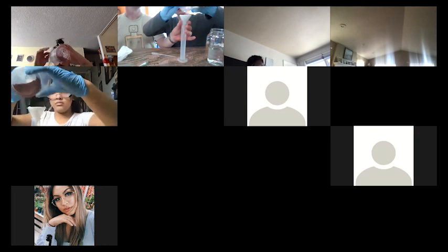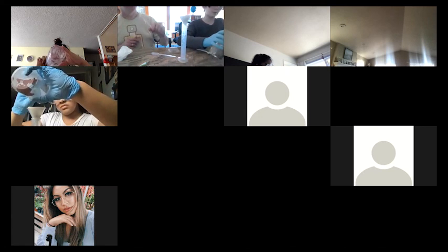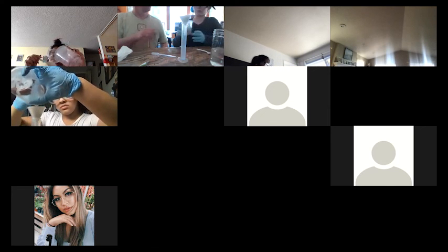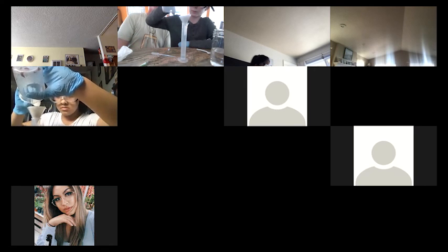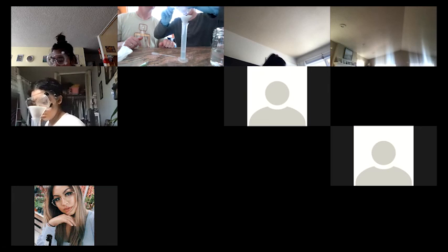There you go. Now to get the rest, you can just dump some water in there, swirl it around real quick, and then into the filter. There you go. Perfect. Oh, don't let it go up too much. There you go. Excellent. Good job, Raj. You still have some in there. There you go.